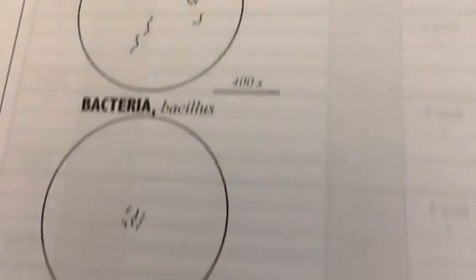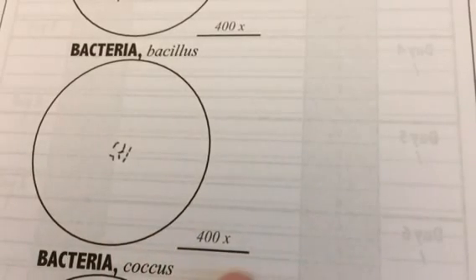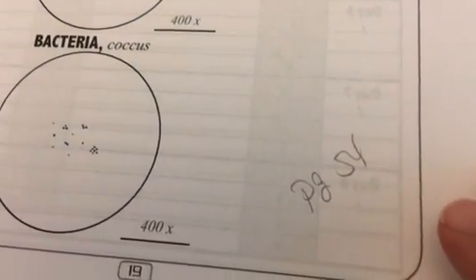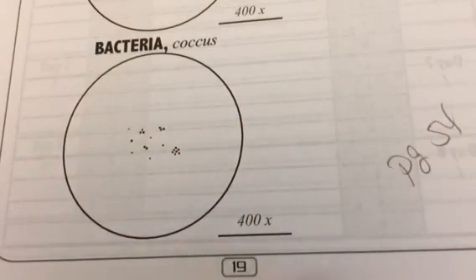Here's a picture of Bacillus, the rod-shaped, also shown at 400. And here is a picture of the Coccus, which are the little teeny round ones, also at 400. But I think we looked at those. I think we had a good view of those today.